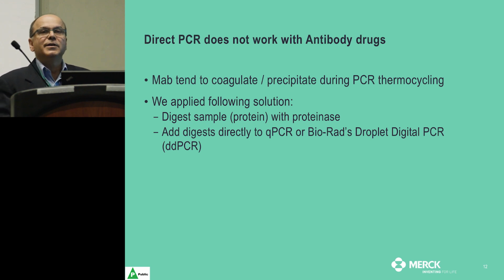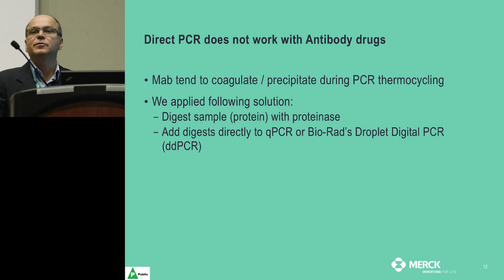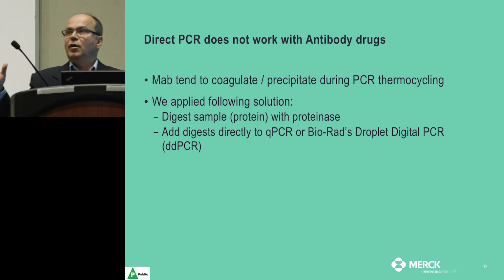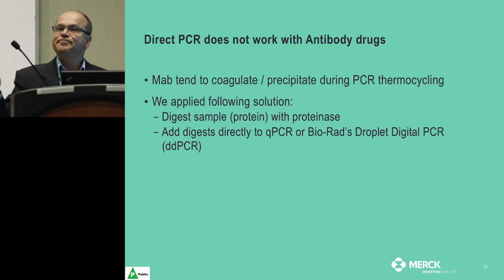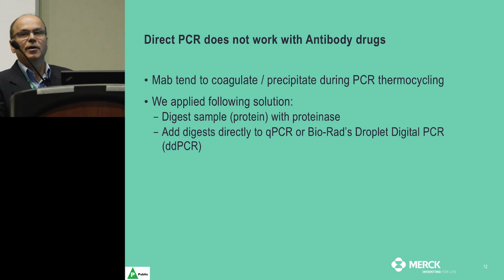So, but we were intent on changing the paradigm of DNA extraction. We have been looking for a protease that will digest the protein, because we are interested in this protein mix, how much DNA is there. If the protein is the obstacle, let's digest the protein. The DNA will be spared. We are interested only in the DNA, and we'll amplify the DNA and quantitate it. So that's the idea.